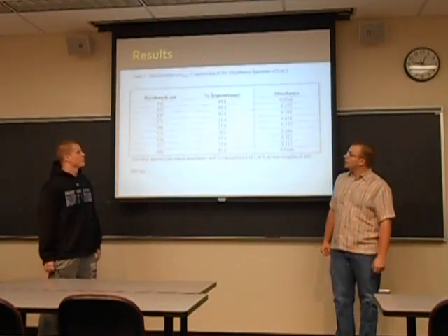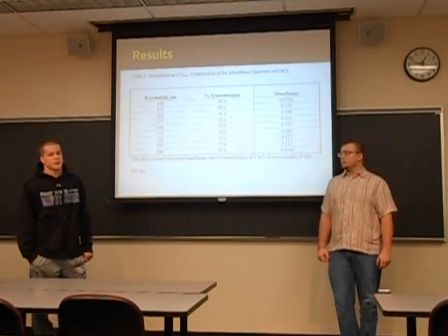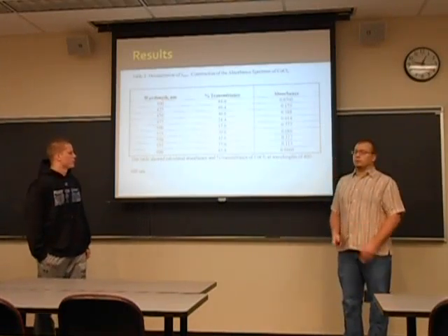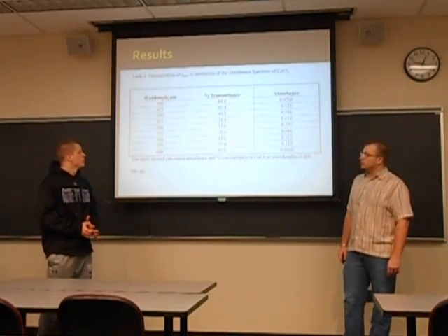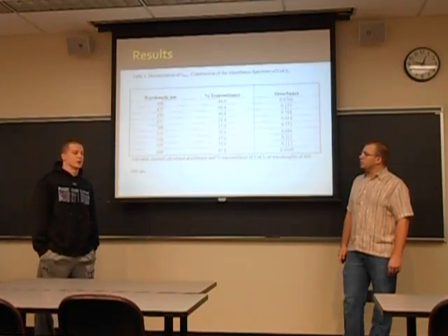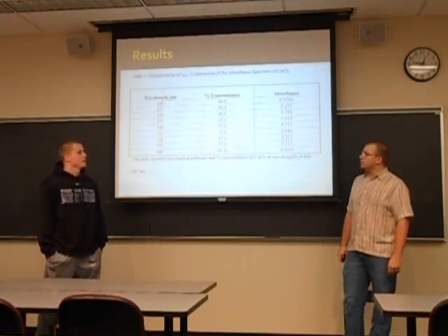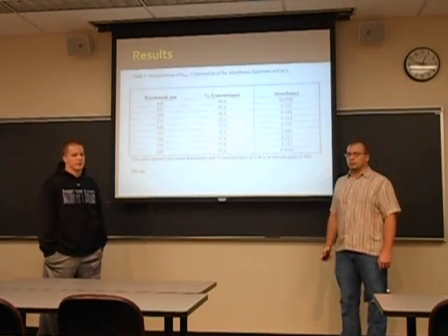Here is a table that we recorded that in. This is showing the construction of the absorbance spectrum of COCl2. This gave us our absorbance and the transmittance from 400 to 600 nanometers. And as you can see, the lambda max we predicted to be 500 because the percent transmittance was the lowest in its column at 17. And the absorbance was 0.772, which is the highest in its column, which gave us our lambda max of 500 nanometers.